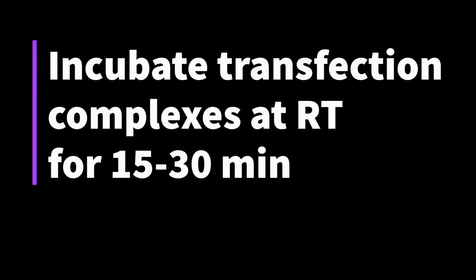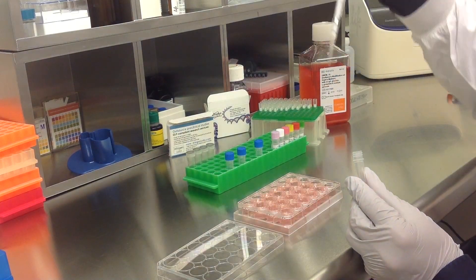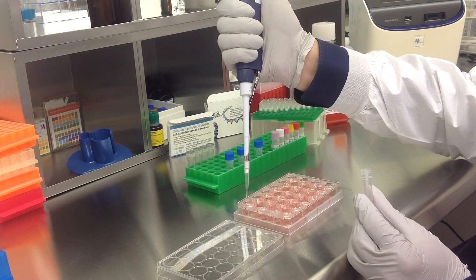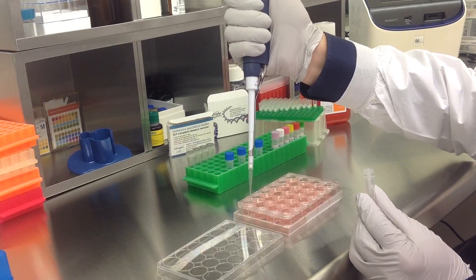Incubate the prepared transfection complexes at room temperature for 15 to 30 minutes, then add the prepared transfection complexes to the 500 microliters of complete growth medium.